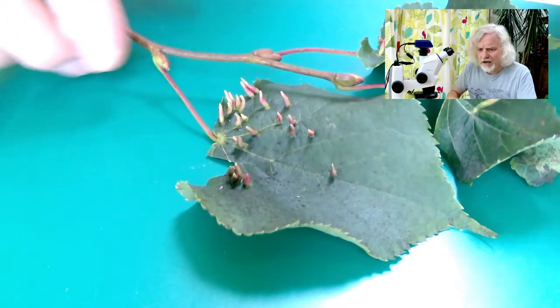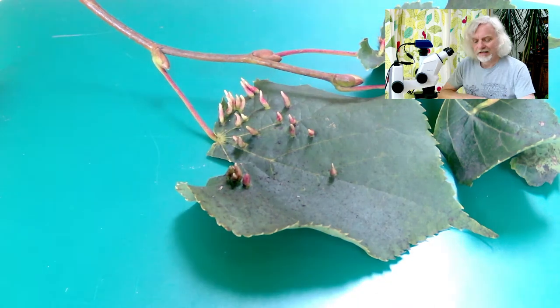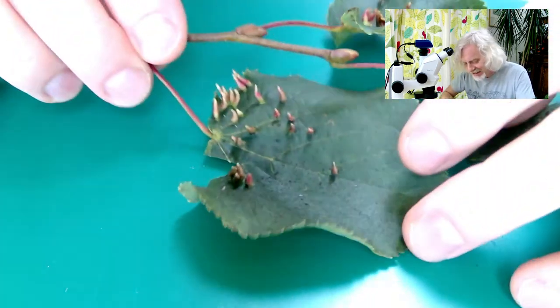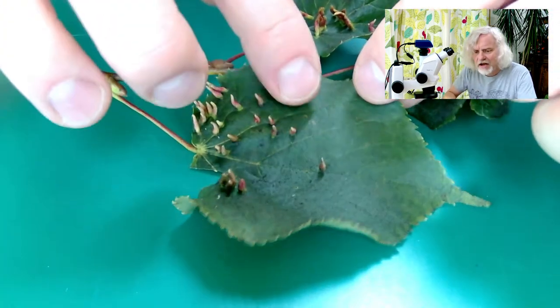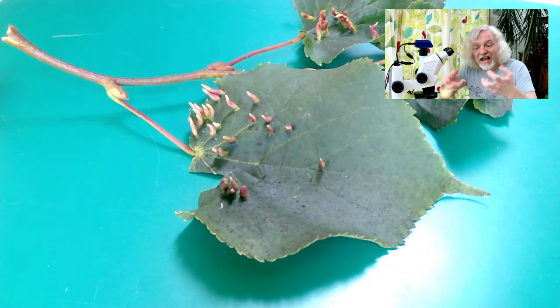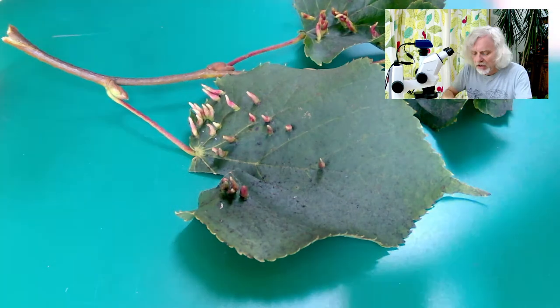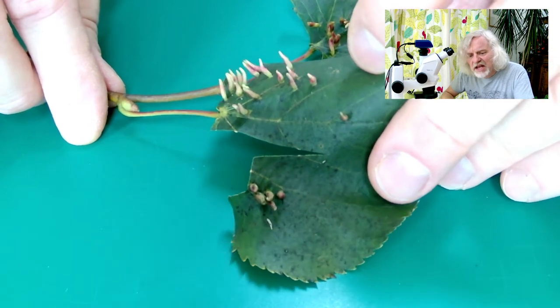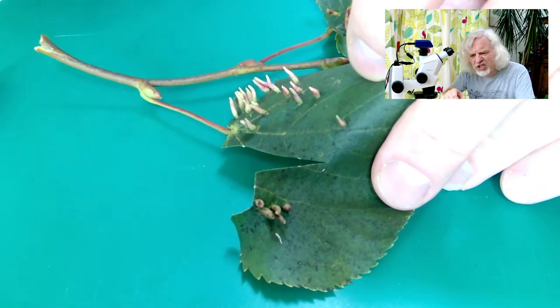Let's start with the desk camera. So these are the leaves of a lime tree — Tilia is the Latin genus — and you can see it's got these peculiar growths on the leaves. The leaves are covered in black mould, which is there because of aphids producing lots of sugary honeydew, and I discussed that in another video when I looked at aphids. But these things are very peculiar — they must be nearly six, seven, eight millimetres long. They're sort of tall little tubey things.